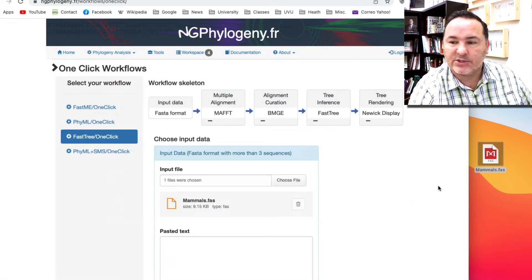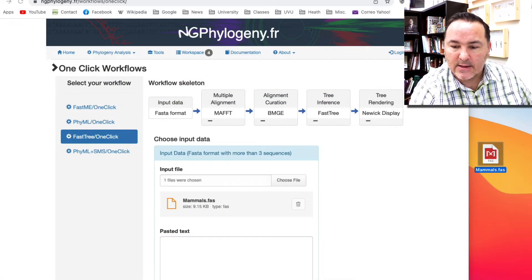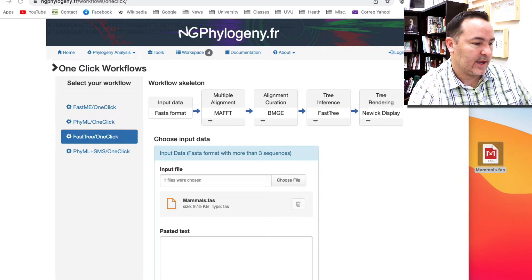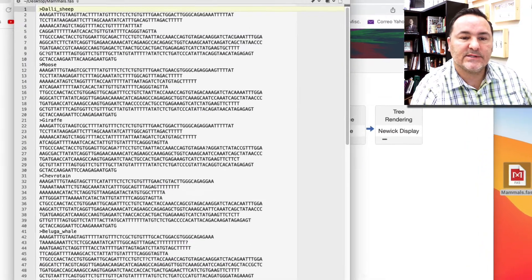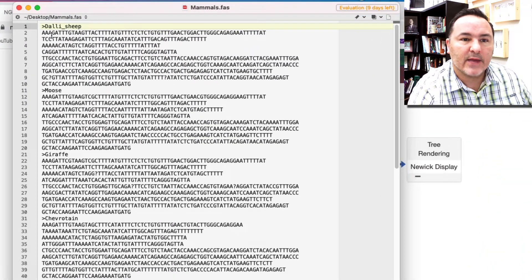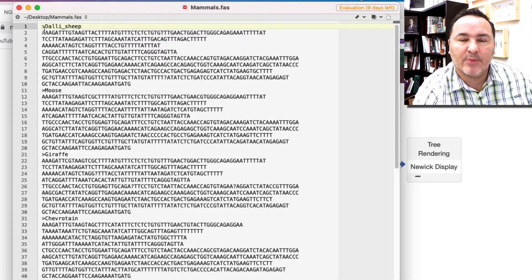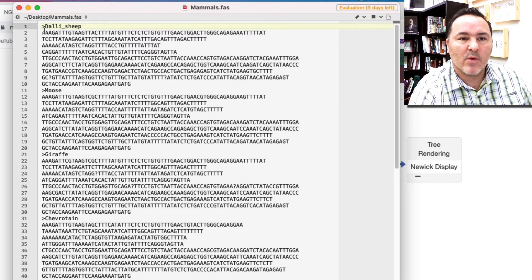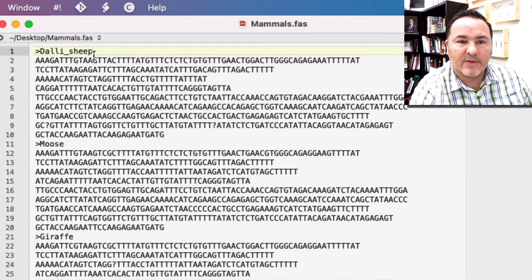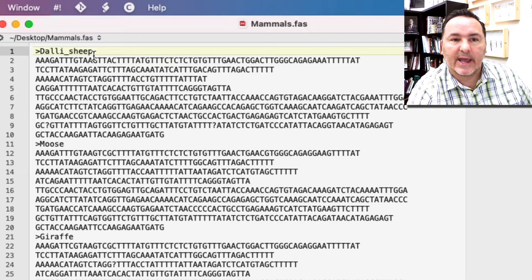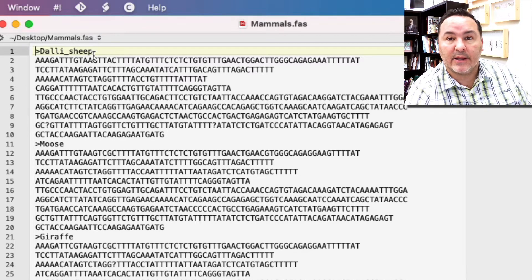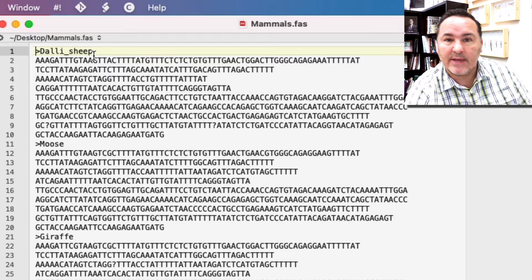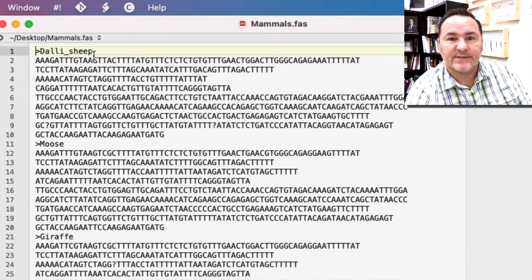I'm going to show you what that actually looks like so you can get an idea of what this looks like. This is just a text file. Remember this is in that really simple FASTA format where you have the greater than sign, the name of the species.